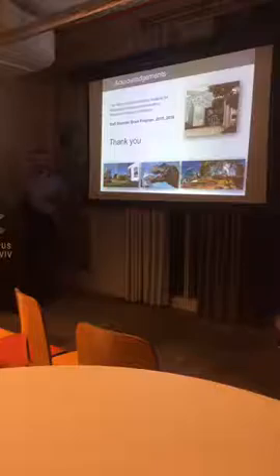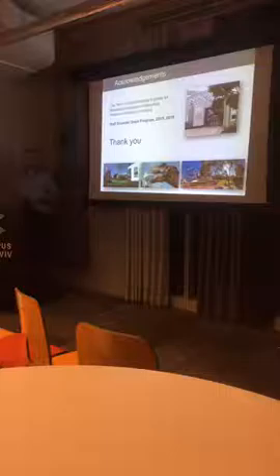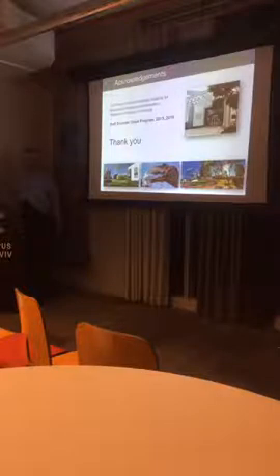But the whisker system using speckles is very well established, especially in the States. What is it called, by the way? This method specifically for brain imaging? Is there a name for it? Laser speckle imaging or laser contrast imaging, and then you see functional cortical activation using laser speckle imaging.